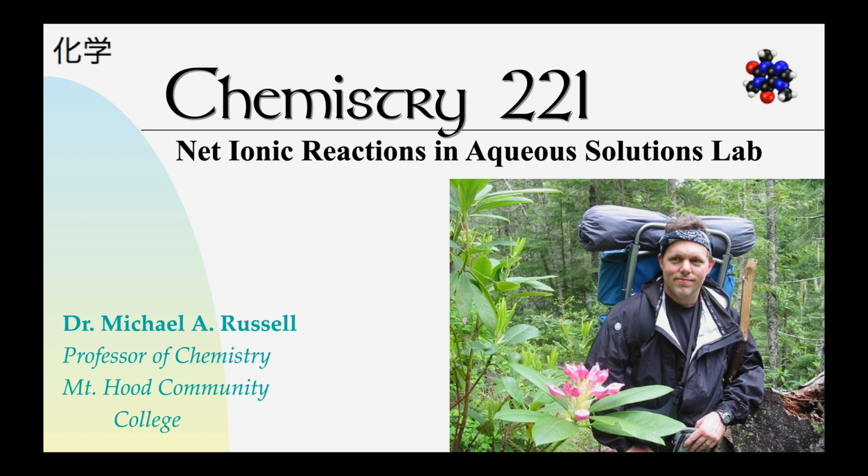And that's pretty cool. The spectator ions are things we're going to be looking for that don't contribute to the action of the reaction, to the chemistry. A net ionic reaction is basically the key elements to figuring out what parts are reacting to make a reaction happen. And it's pretty neat. So without further ado, let's get into this lab and see what's all happening.